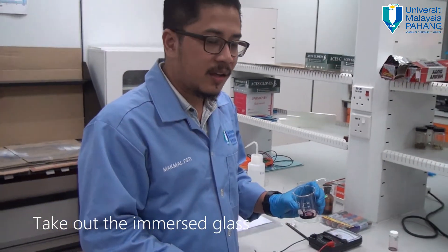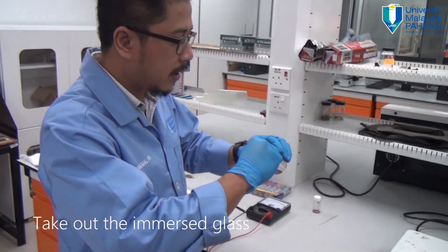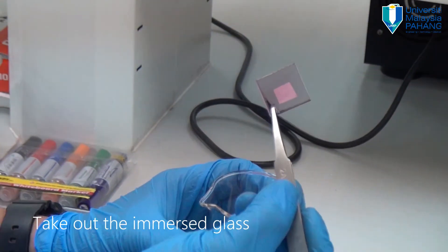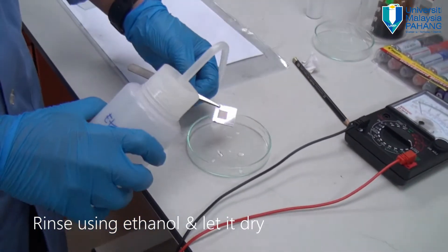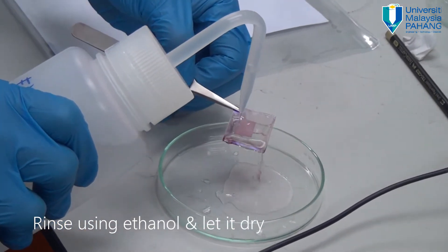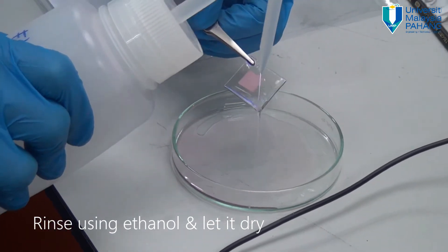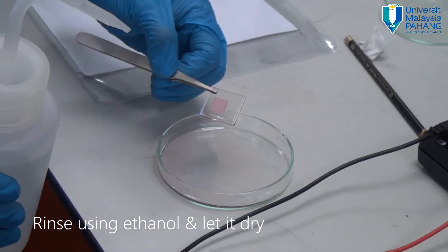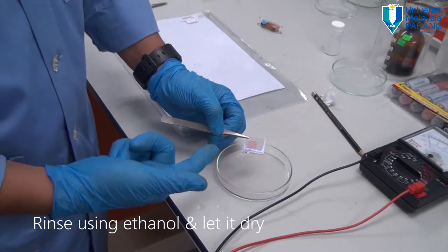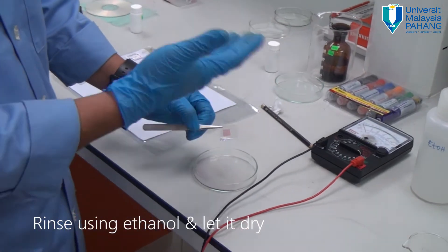After 10 minutes, take out the FTO conducting glass from the beaker. As you can see, the color of the titanium dioxide has already changed to reddish or pinkish. Wash it using ethanol. The color of the titanium dioxide remains pinkish, which means the dye has been absorbed and attached strongly onto the titanium dioxide layer. Leave it aside to dry for a while.